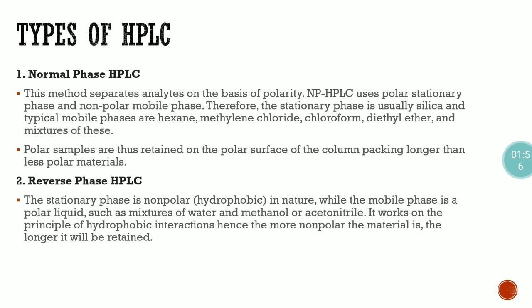Second one is reverse phase HPLC. The stationary phase is non-polar in nature while the mobile phase is a polar liquid, such as a mixture of water and methanol or acetonitrile. It works on the principle of hydrophobic interaction, hence the more non-polar the material is, the longer it will be retained.